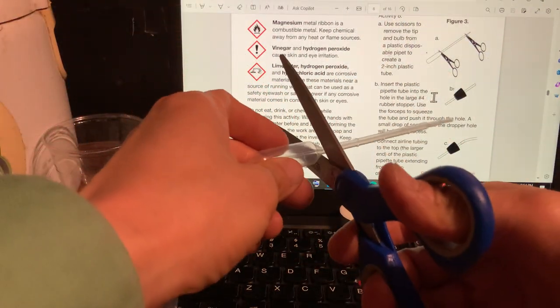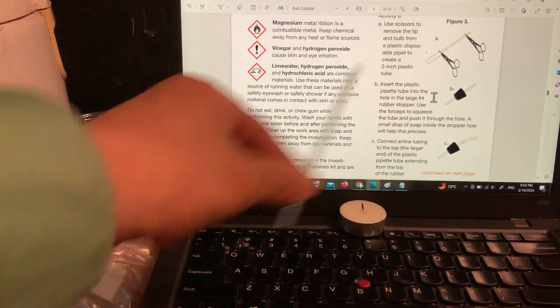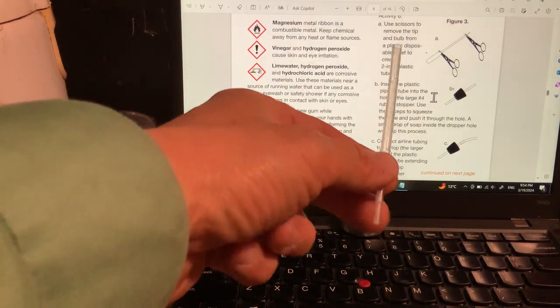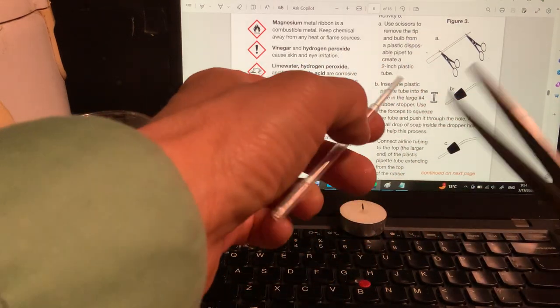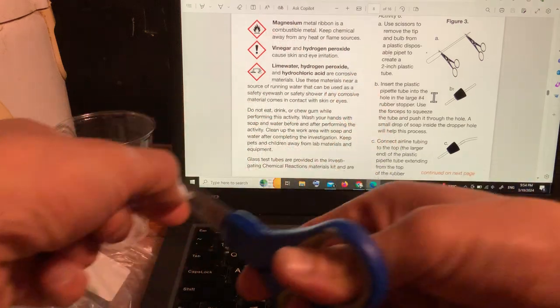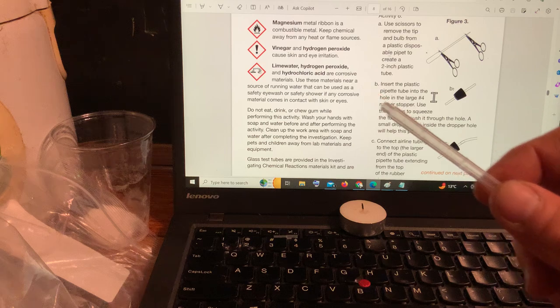I'm going to take this right there, at the base. Bam! Right there, there you go. I'm going to take off this narrow tip and take it off. Right there, bam! Okay, good. And then I'm going to stick this into my stopper.